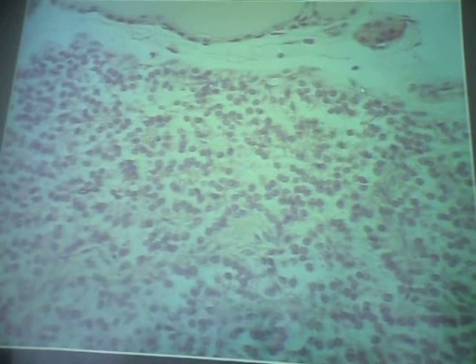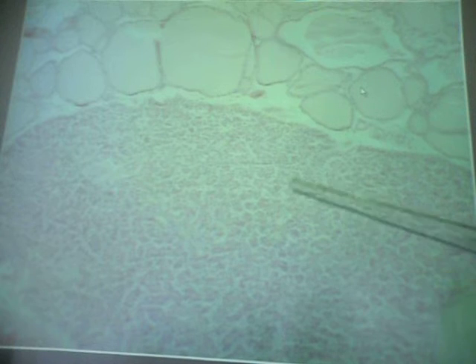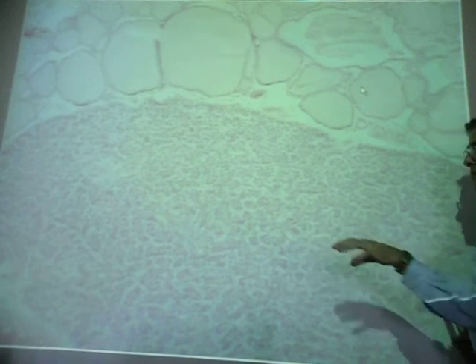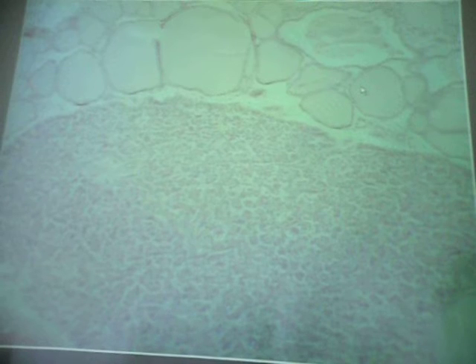Now, also in close proximity of the thyroid is the parathyroid, which looks distinctly different. This is parathyroid. See, the thyroid has all these follicles. The parathyroid looks rather glandular, rather granular in appearance. That's because the nuclei are the major feature in the parathyroid. Parathyroid are little lobes of tissue sort of surrounded by thyroid tissue, but they have a distinctly different function. The cells here, unfortunately, are called chief cells. Where do we see chief cells before?